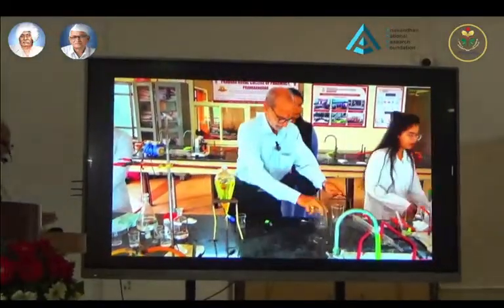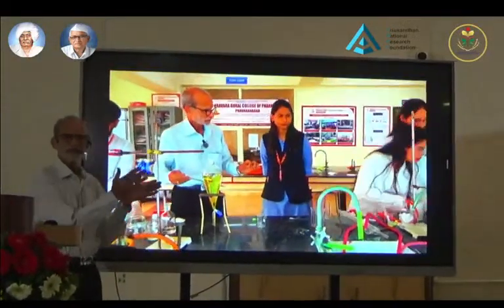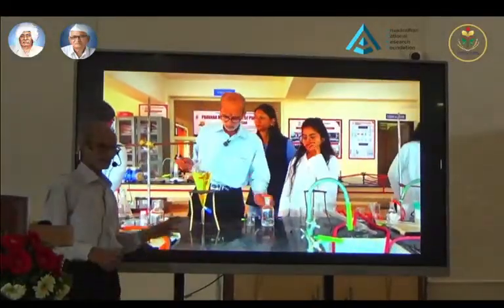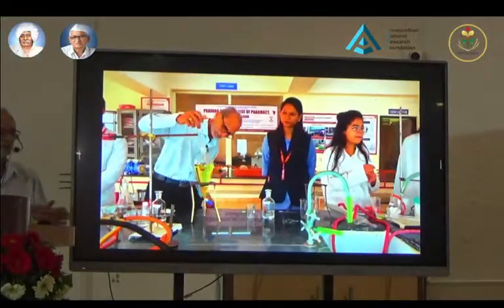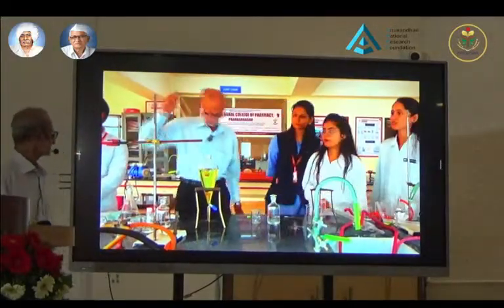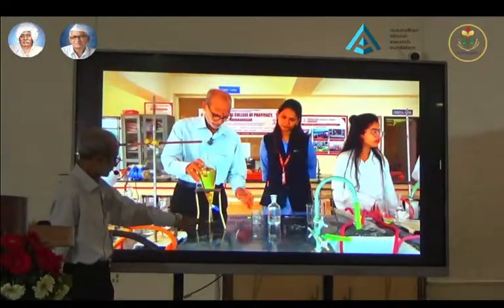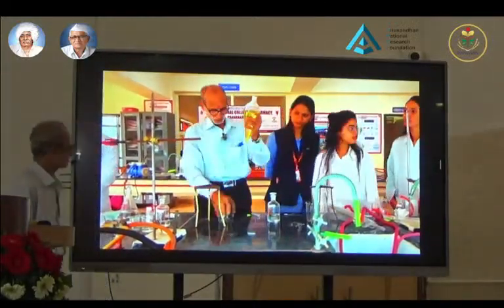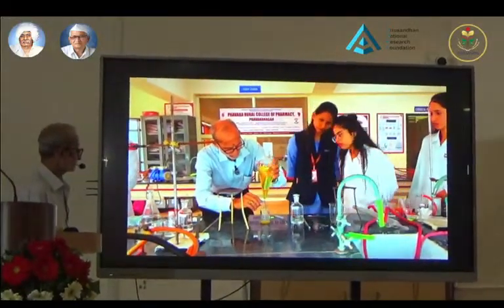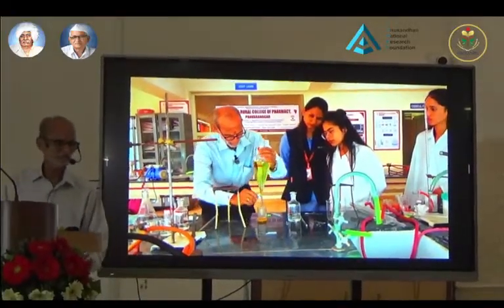Initially when you extract with toluene, all hydrophilic impurities remain behind because toluene is a lipophilic solvent. Now it is extracted with the sulfuric acid, so all lipophilic impurities remain in the toluene layer. Okay? The layer got clear and now it will be separated. So now the quinine is present here in the form of quinine sulfate.